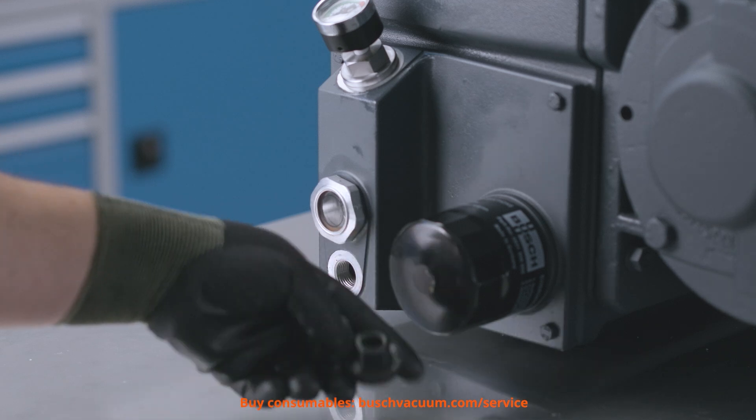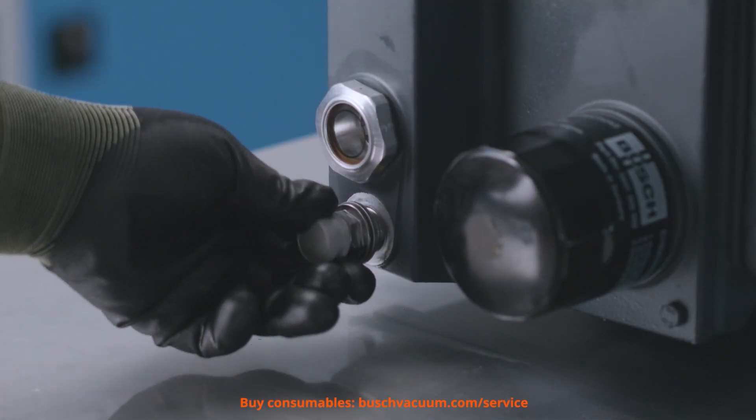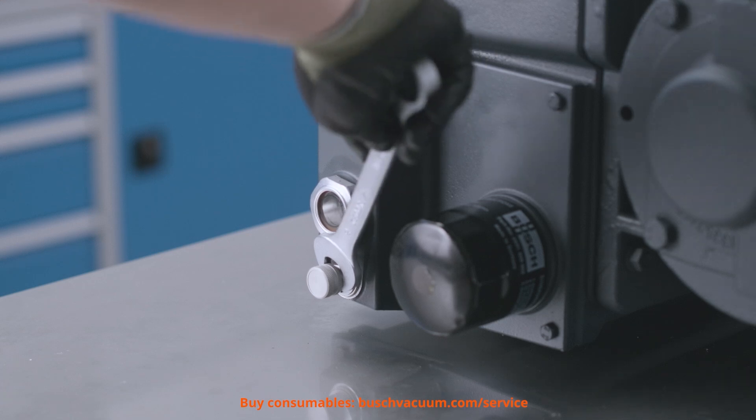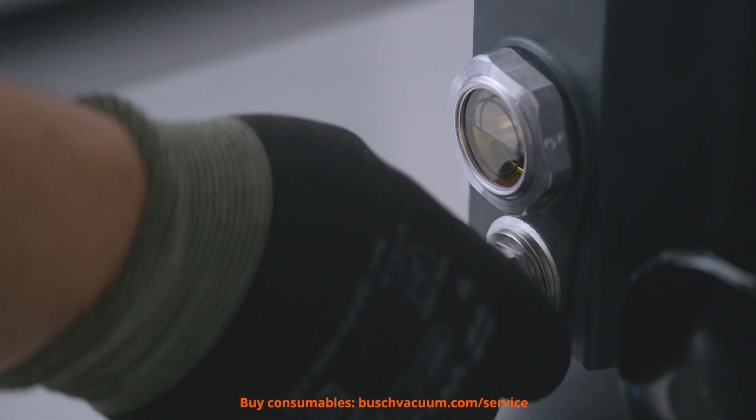First, we drain the old oil and make sure that no oil is left inside the pump. To do this in a practical and clean manner, we use the Busch oil drain valve kit.